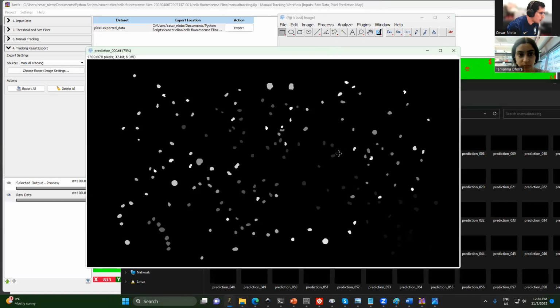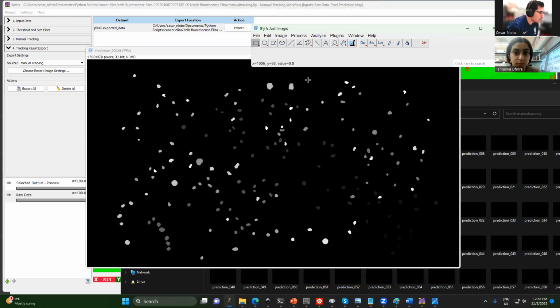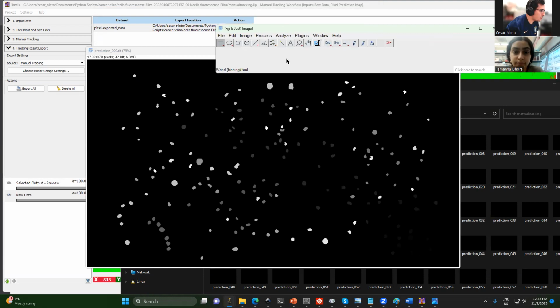each of them is going to have a different value. So the background, you can see here, is 0. The cell has value 100. Can you see here? Yeah. Exactly. So 170, 137, this is 138, this is 132, this is 152.